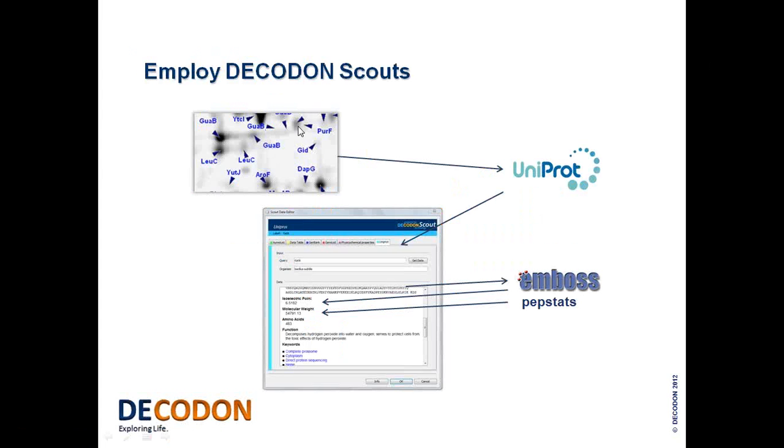Based on these protein identifications that I can see on my image now, you would typically then create a list of your identifications and maintain a certain table. You would take for each single row the protein identification, do a query, for example in UniProt, submit the query and get back different attributes, for example functional categories, the protein sequence, the isoelectric point, molecular weight, the number of amino acids, whatever. And then you would have to copy and paste all these attributes from the response of your web database to the table that you maintain. And this is not only very time consuming, it's also tedious, it's no fun, and it's also erroneous.